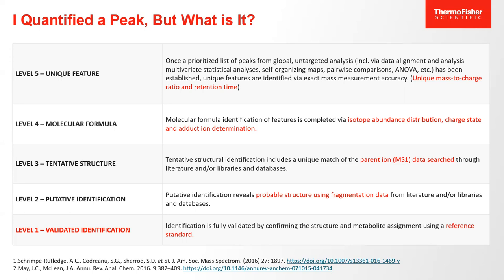Typically, you're gonna pay about $10 for a purchase compound. You're gonna pay about $40 to $60, $80 for a reference compound, okay? And if you're talking about looking for 600 to 700 reference compounds, you're talking $8,000 or $9,000 for your purchase standards, and you're probably talking $60,000 or $80,000 for your certified reference standards. You can quickly build up an expensive research project.